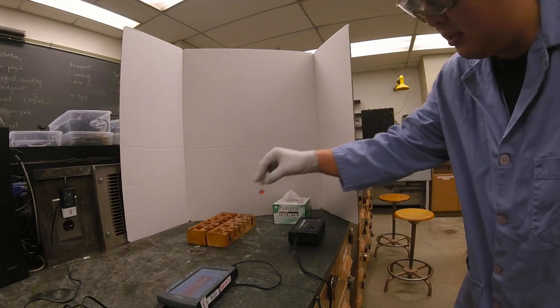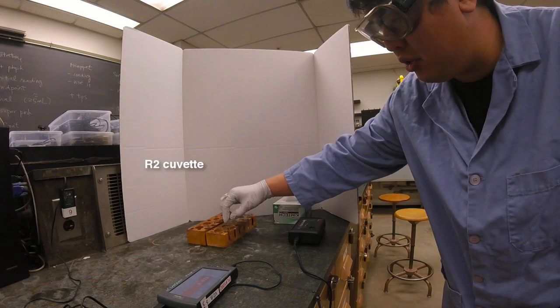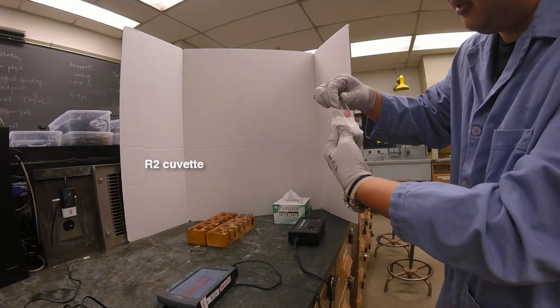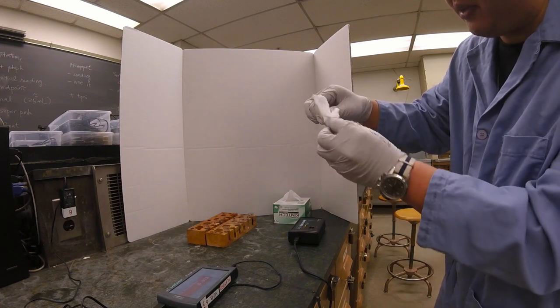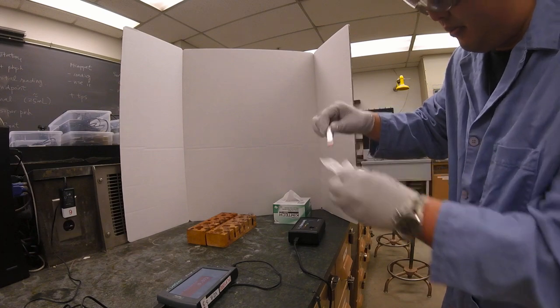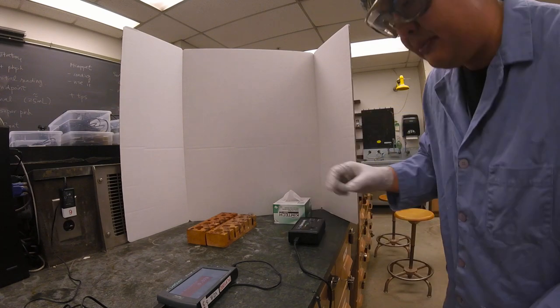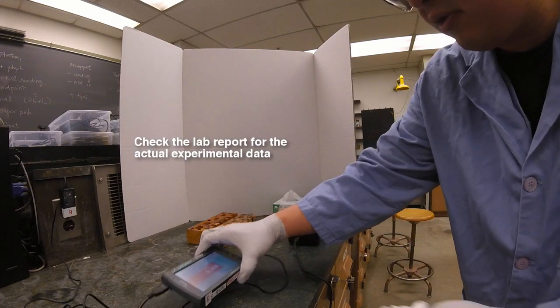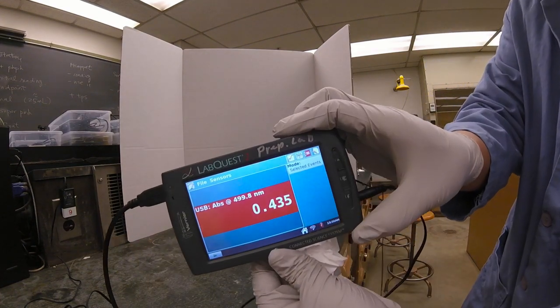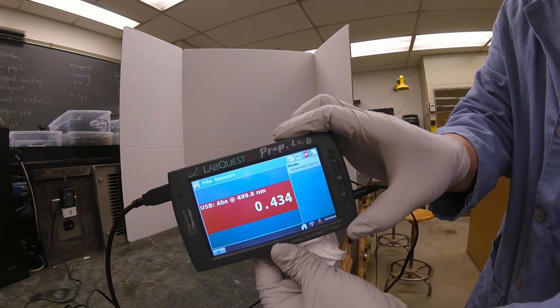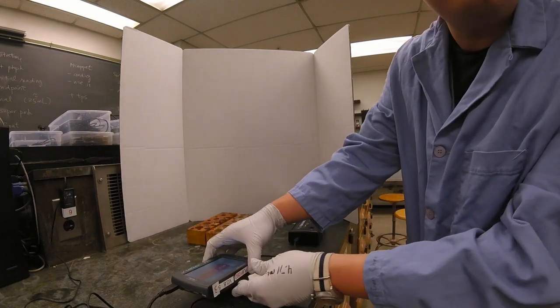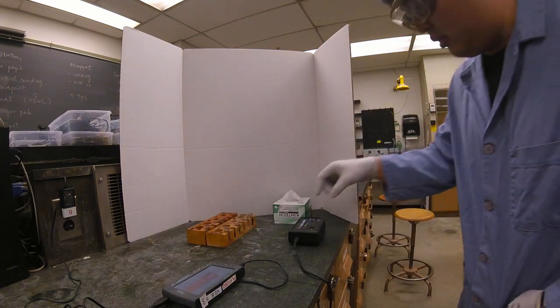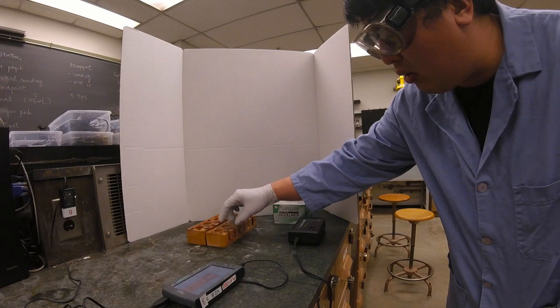Taking R1 out, I'm going to take R2. Again, you want to wipe the cuvette to make sure there aren't any scratches or anything that could interfere with the light path. Put that in and I get a reading of 0.434 to 0.435. As you see, the number went down. According to the last video, we should expect this because R2 should have a lower concentration than R1.